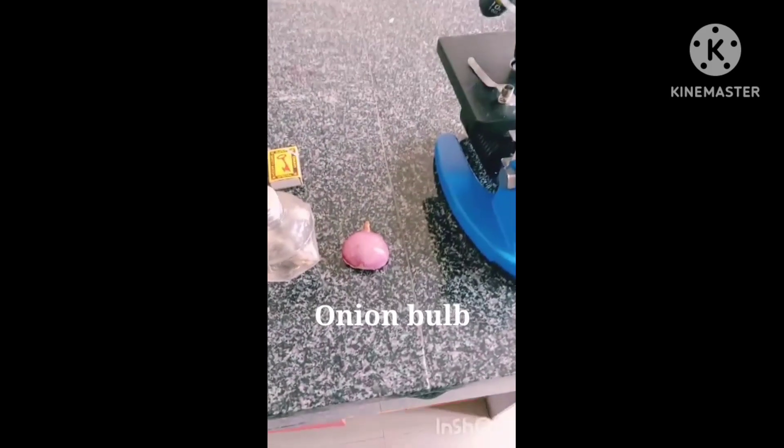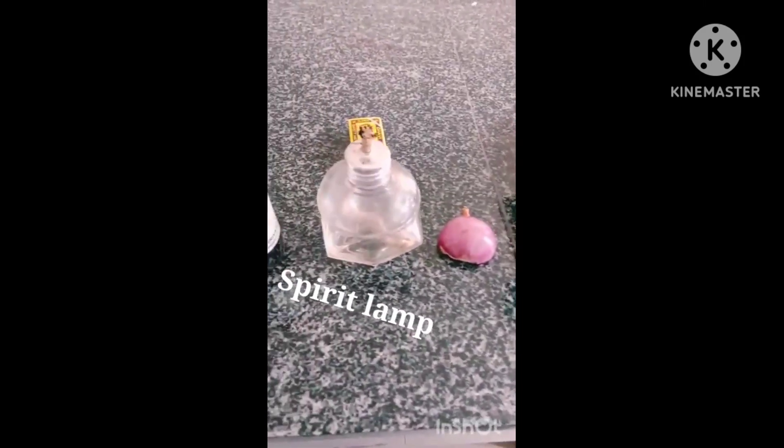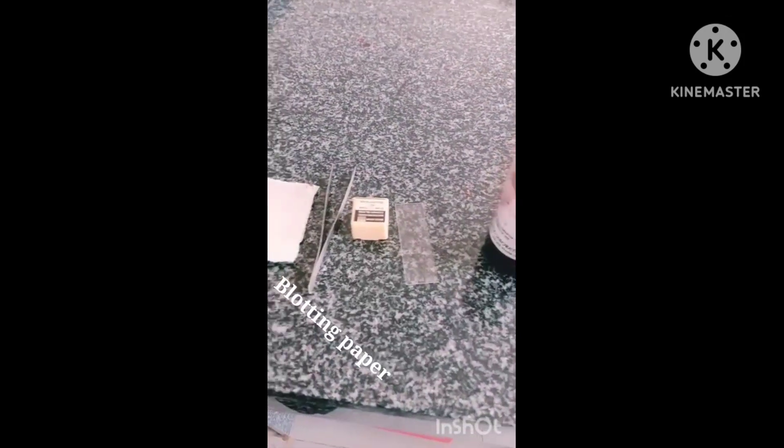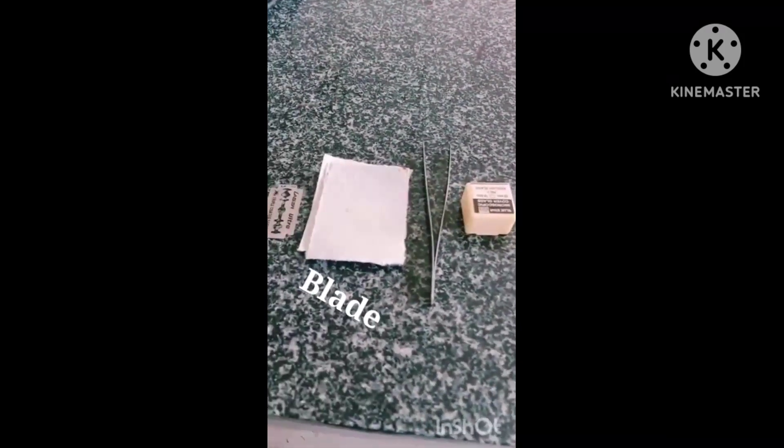Requirements: microscope, onion bulb, a spirit lamp, stain, slides and coverslips, forceps, blotting paper, and blade.